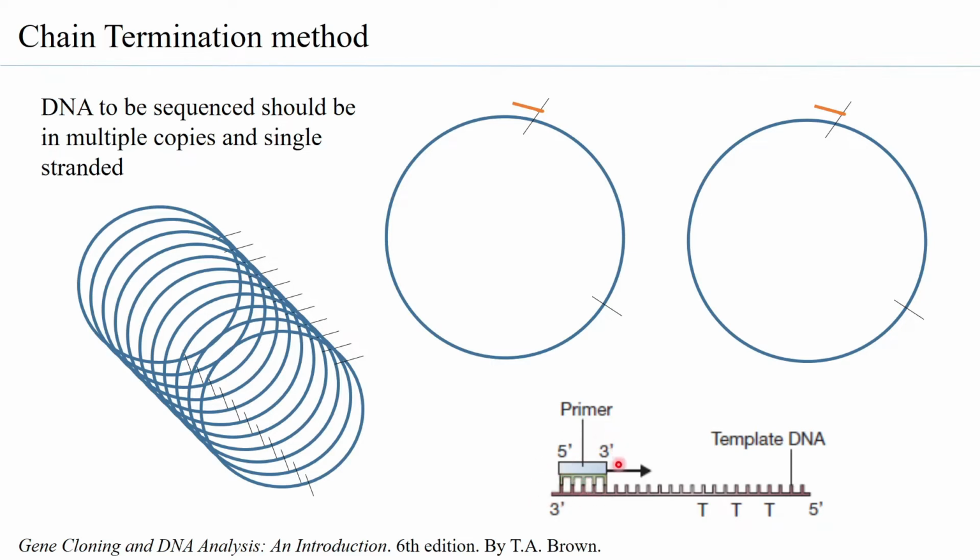So this oligonucleotide in fact acts as a primer, and so you have a free 3' OH group that is present, and this free 3' OH can be used by the DNA polymerase to synthesize the DNA, which is the second principle of Sanger's chain termination method, that is, replication of a single strand should be possible. And so this DNA that has to be sequenced is present in the form of single strand, and just upstream of that is attached a primer, and using this primer this DNA segment can be synthesized.